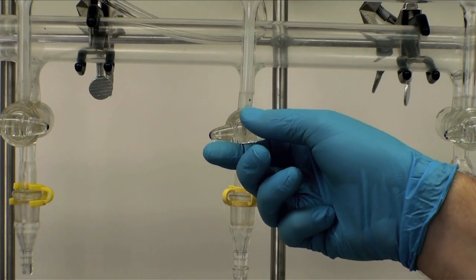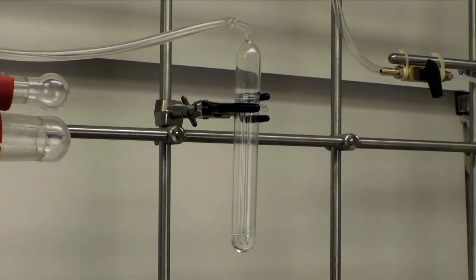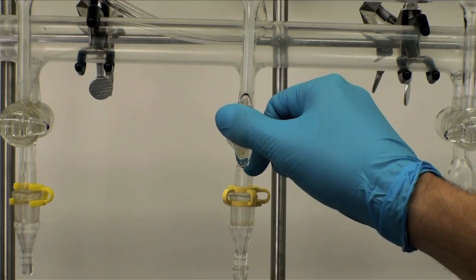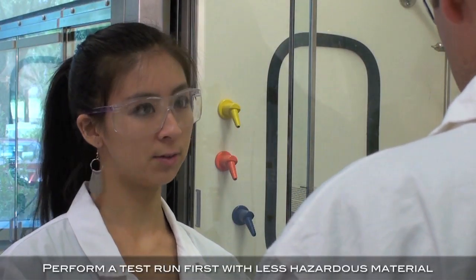When you switch to fill the flask with nitrogen, you need to do it slowly and watch the bubbler. If you do it too fast, there's not enough nitrogen to compensate for the vacuum, and air will be sucked through the bubbler. You see? Now we need to repeat this procedure 3 times. Here, I have a round bottom flask with some solvent we can practice with.